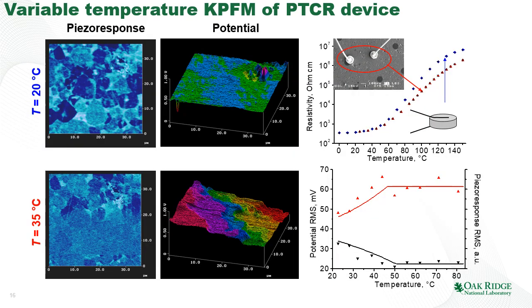And I can even compare these measurements with the piezoresponse microscopy measurements. So piezoresponse gives me a measure of piezoelectricity.